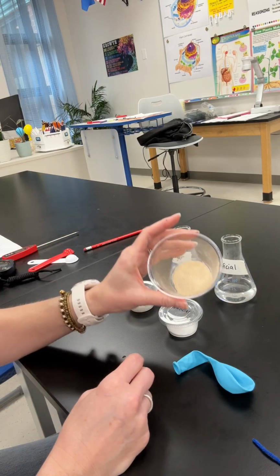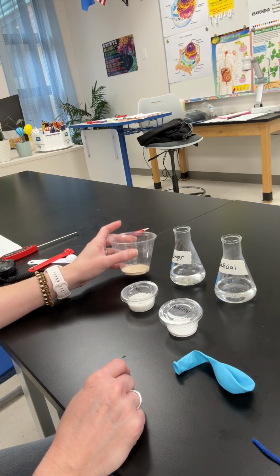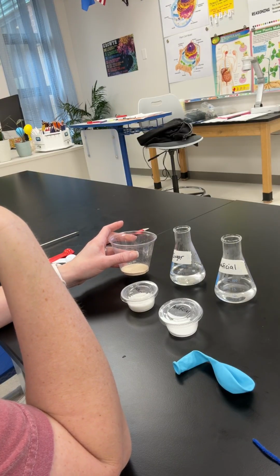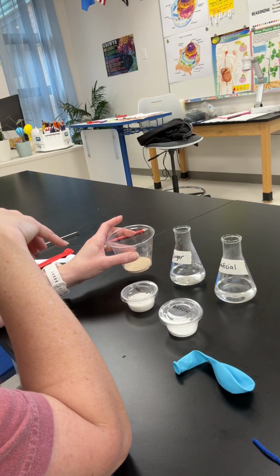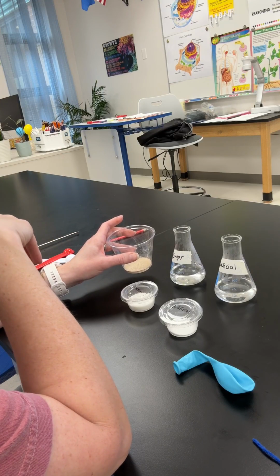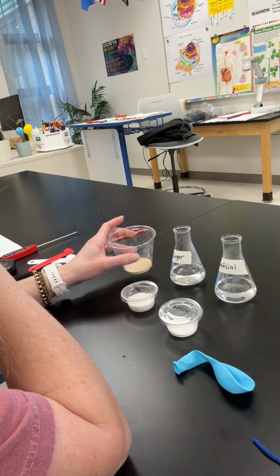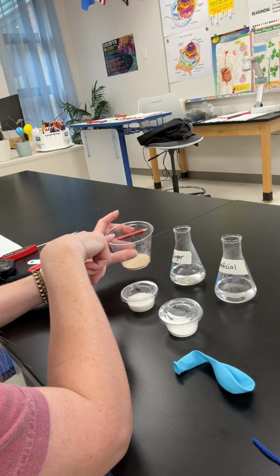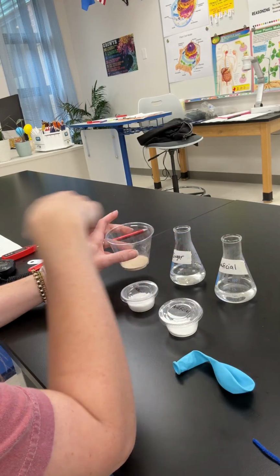For yeast, which is what we're going to be using today, this is a unicellular organism, and when they do cellular respiration, they do anaerobic respiration, which doesn't require the oxygen that we need. When they are creating energy through fermentation, they have different outputs: carbon dioxide and ethanol. So we're going to be looking at the cellular respiration rate of yeast in these two different food sources.